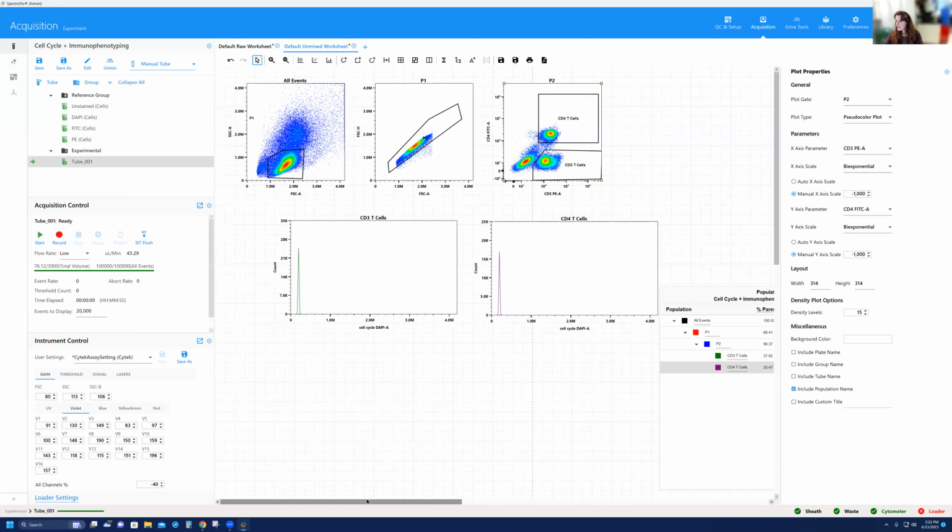Okay, so I definitely abused my time and went a little bit over. I think what makes the most sense to me is to skip the analysis portion for cell cycle, since we already have analysis of cell cycle covered in FlowJo in one of our prior sessions, but I'll leave that to Derek and Rui and open it up to any questions that we might have. Very good. Thank you, Kathy. This is wonderful. So we can stop my sharing for now too.